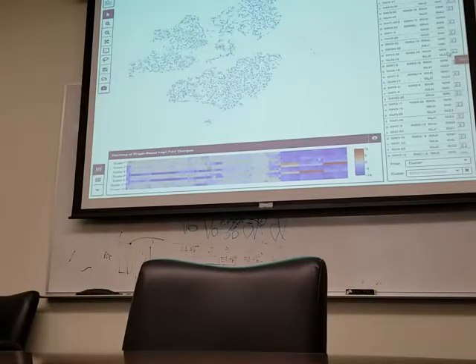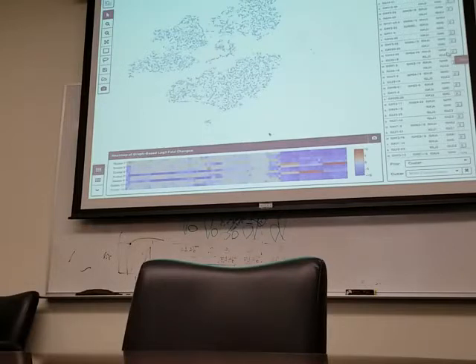So Chris and I subsampled that data for samples with varying degrees of clonality, some that had just 2 expanded clones and the rest were small, some where there was a distribution of clones, some that was pretty flat. And we subsampled that to 400 sequences, and then clustered those to see if with just 400 sequences, can we detect clones that may occupy 5 or 10% of the total number of sequences that we sample? And the answer was yes.